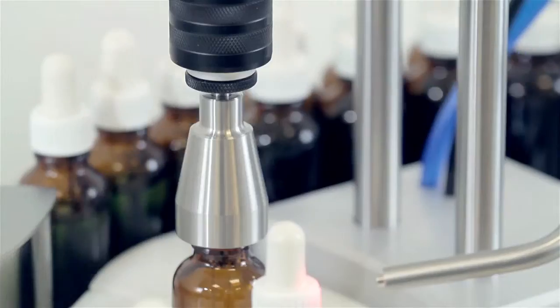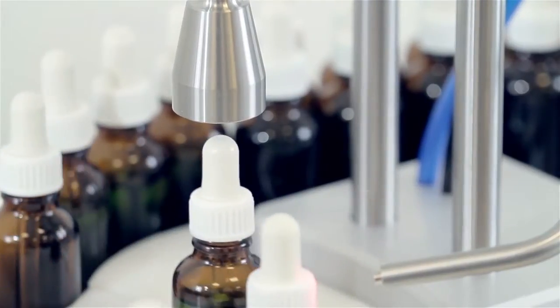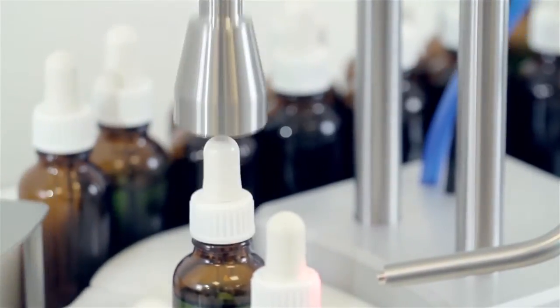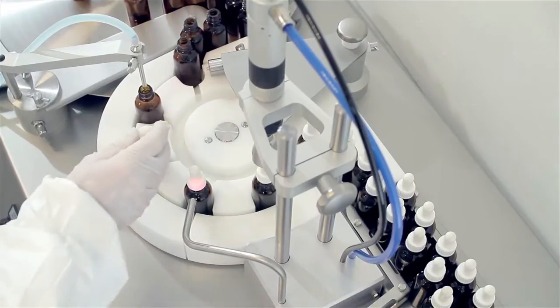The FlexFeed 30 provides consistent cap torques that reduce the problems of leaking bottles whilst protecting operators from painful repetitive strain injuries.